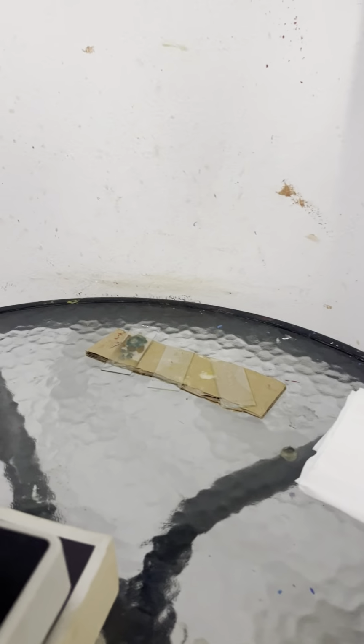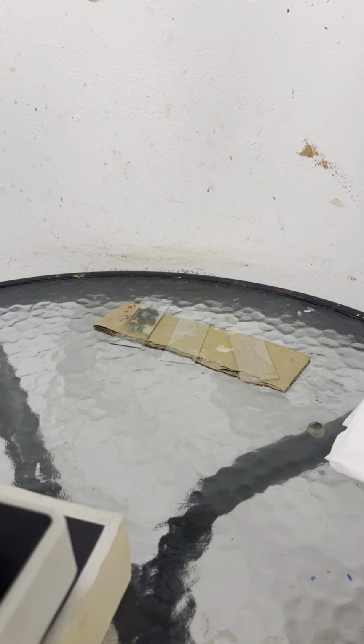Good evening. We should continue the microscopic review. We have 3 slides. The saltwater aquarium, the water from the metal aquarium that was mixed with mostly salt and baking soda.